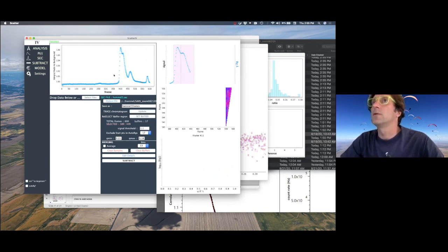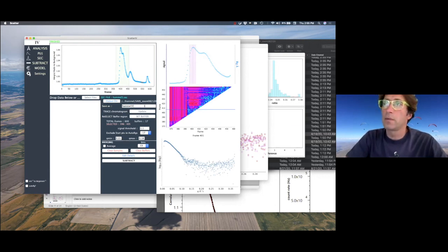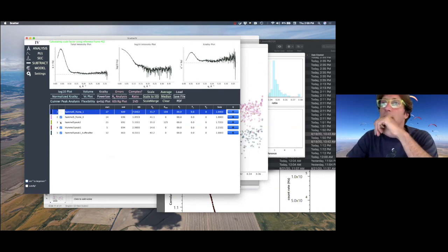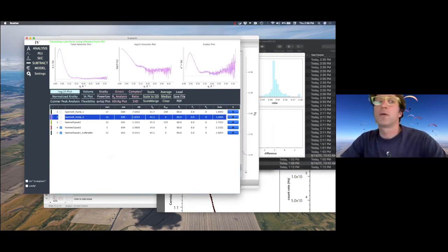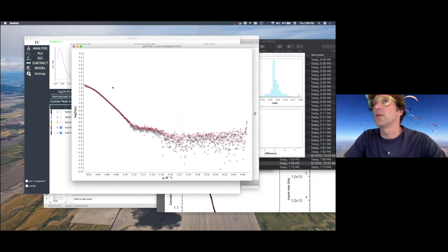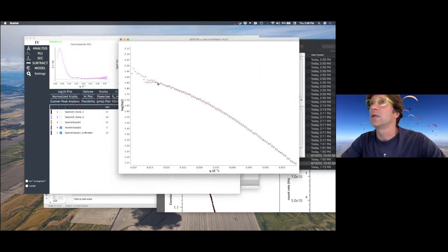The computer is super slow. Nope, it's done. Okay, let's take that peak right here. Okay, peak 1, buffer after, and just compare those. And when you compare those two, oops, scale this. So this is when you're playing with the buffer subtraction issue. In this case, you really need to be careful when you cut the data.